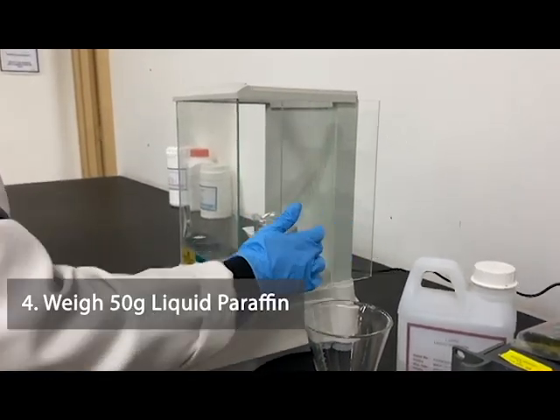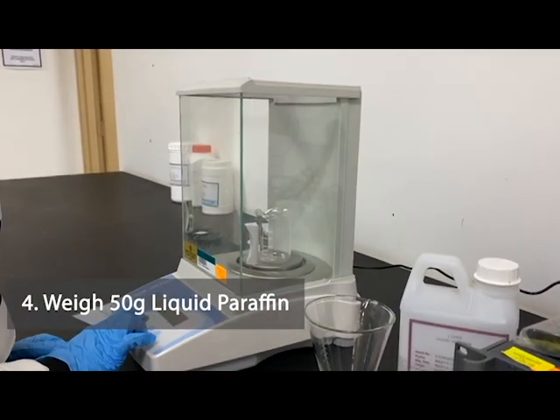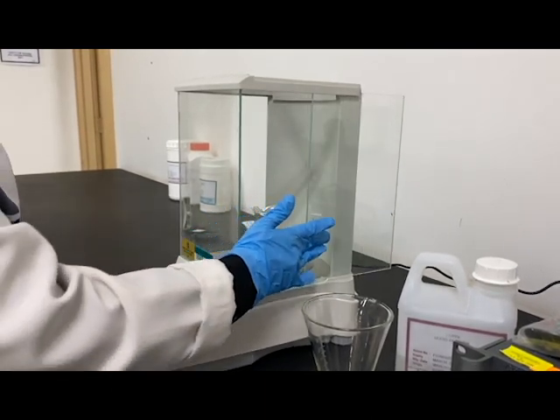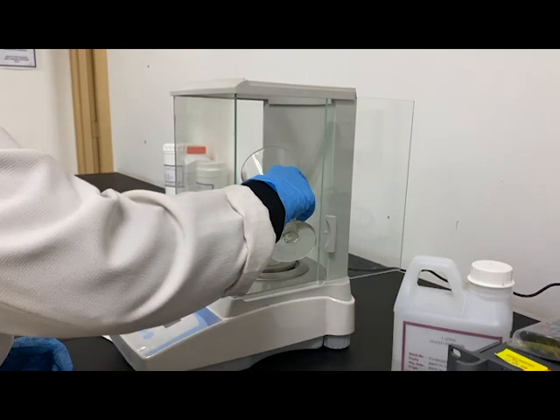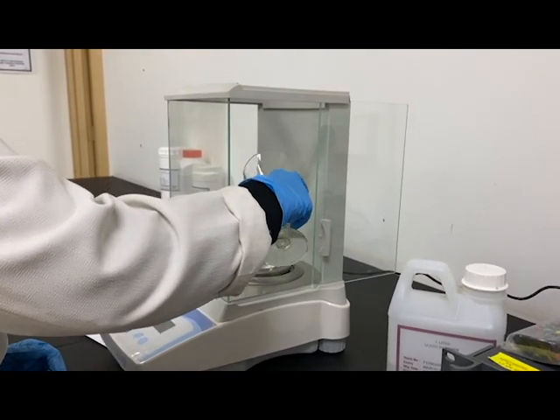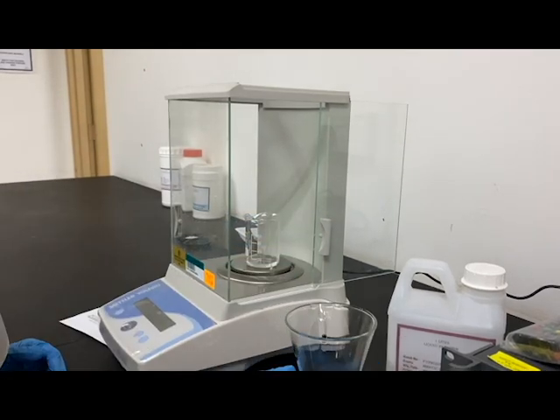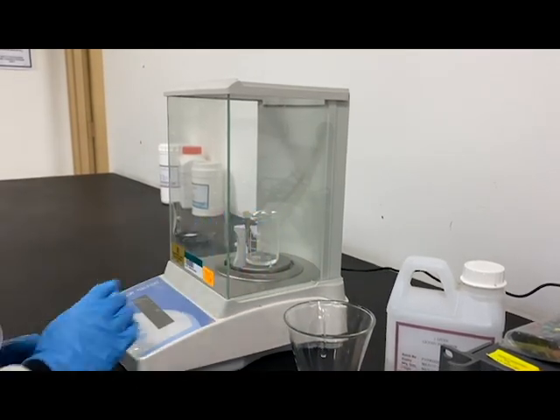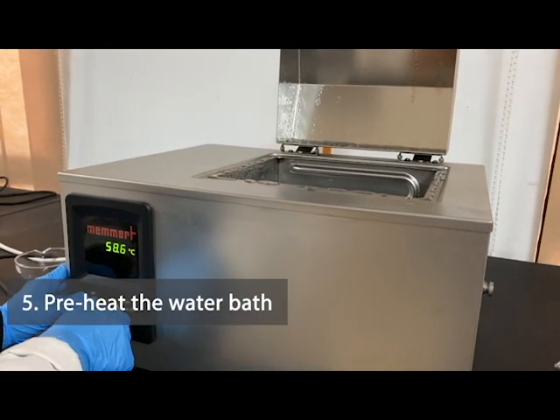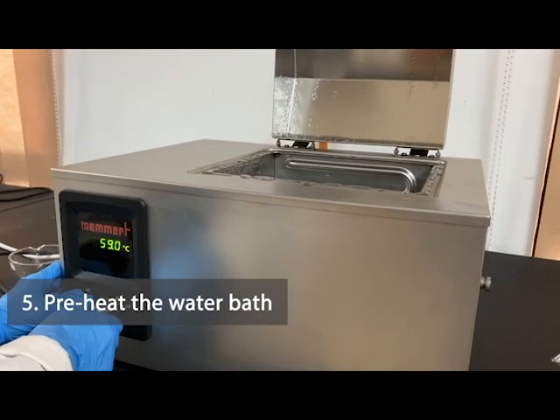Then, weigh 50 grams of Liquid Paraffin. At a temperature of 60 degrees, preheat the water bath to the desired temperature.